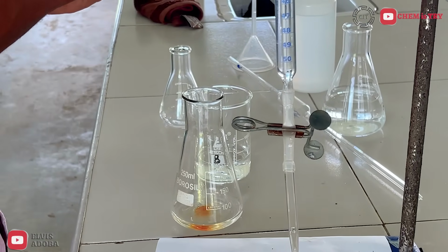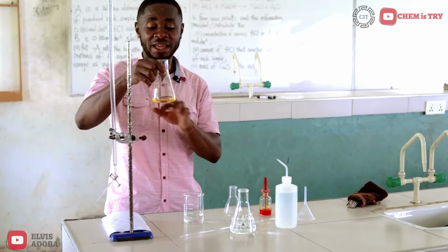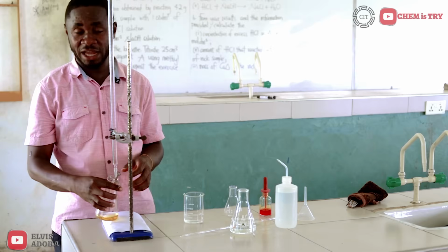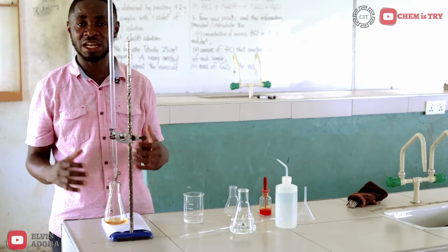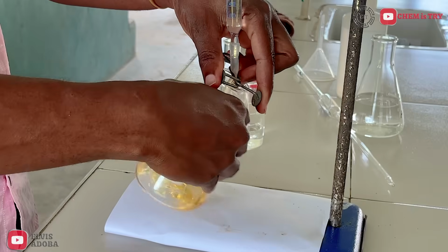So I added 2 drops. I swirl and I get a yellow solution. So I start with my titration, releasing the acid into the conical flask containing my base with my methyl orange indicator.